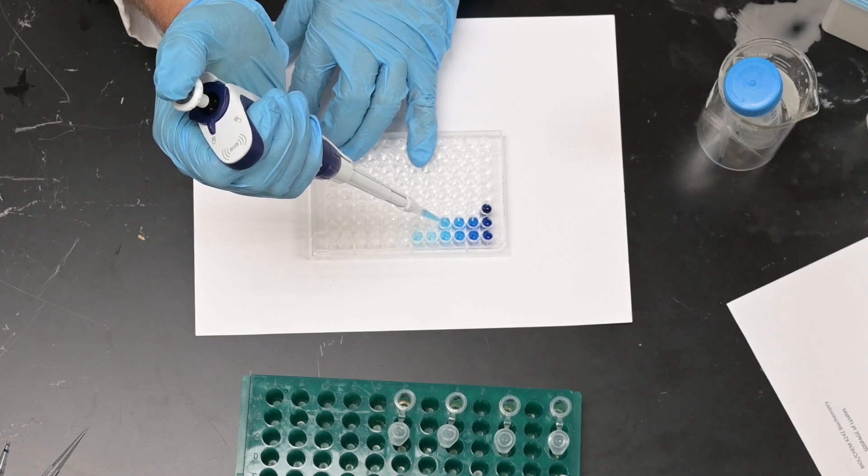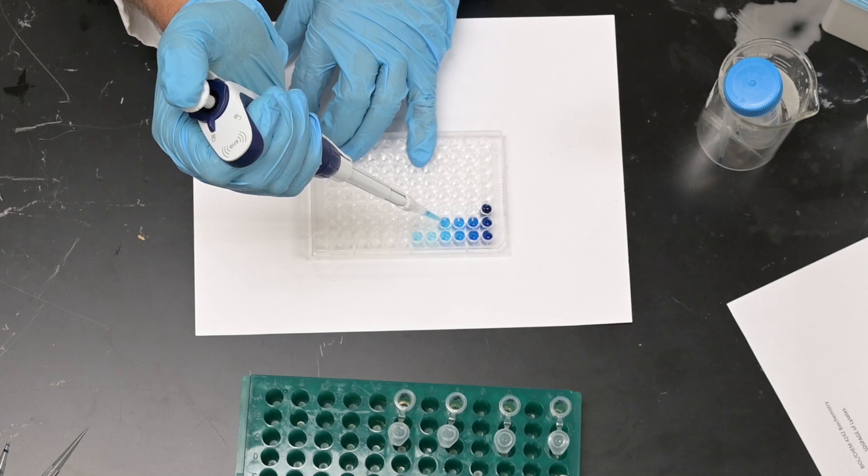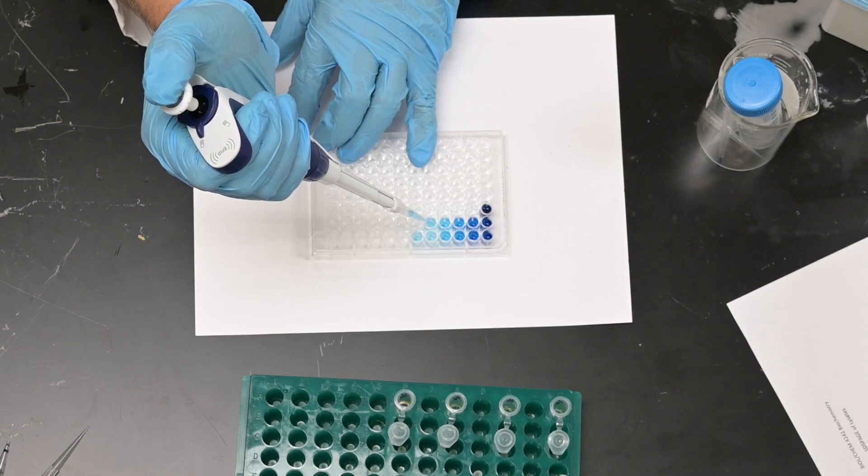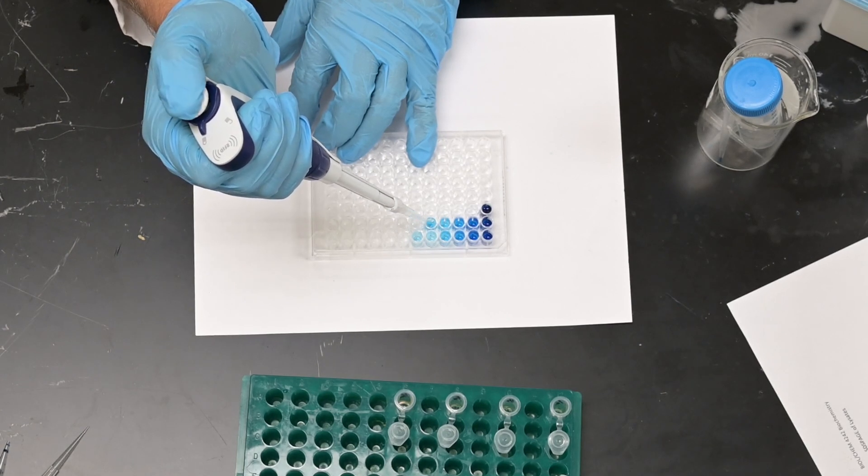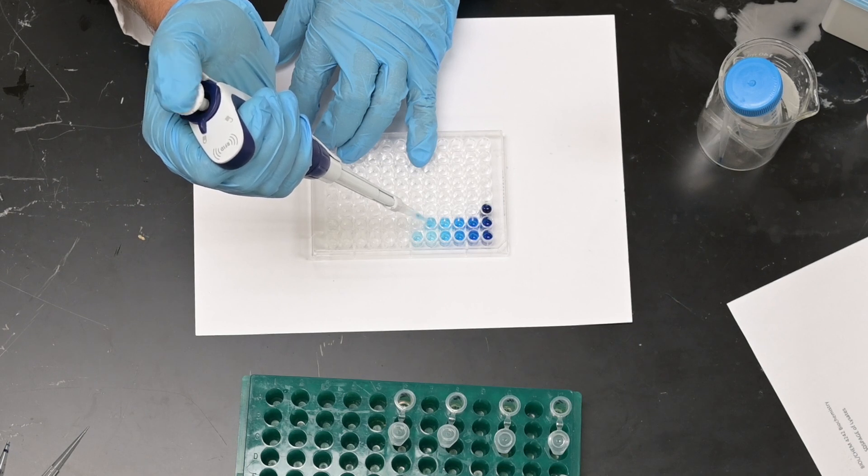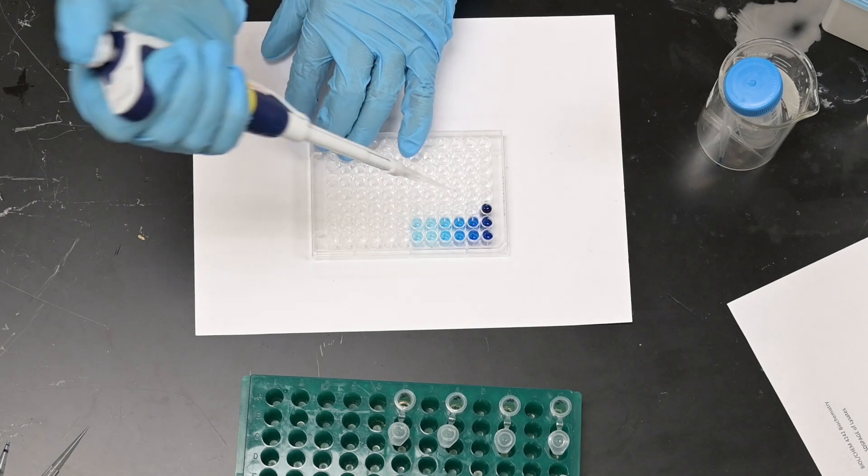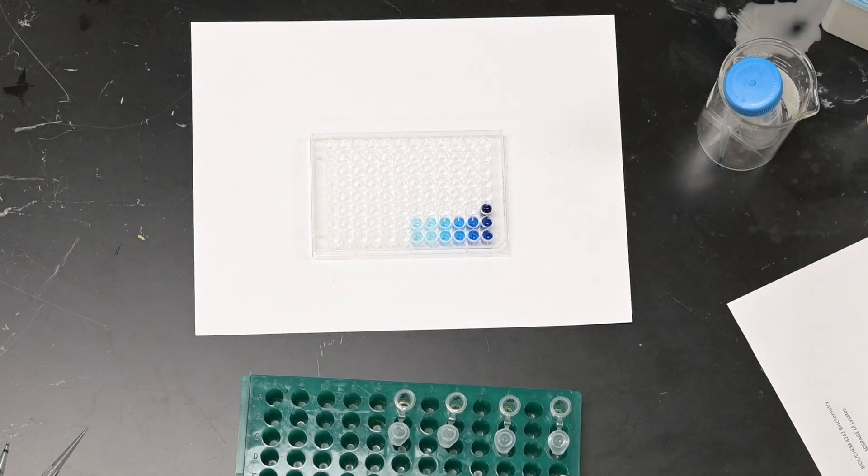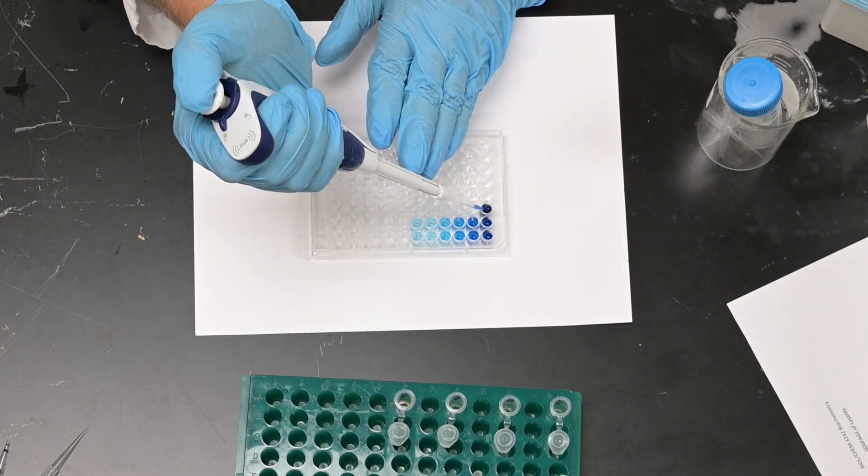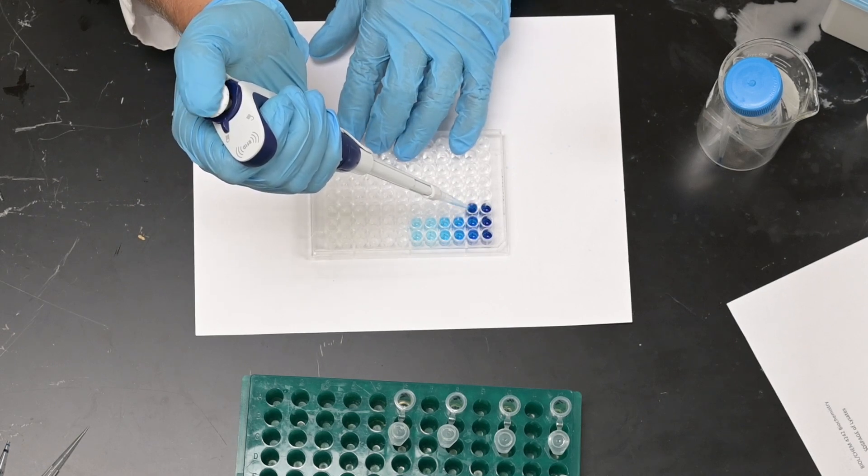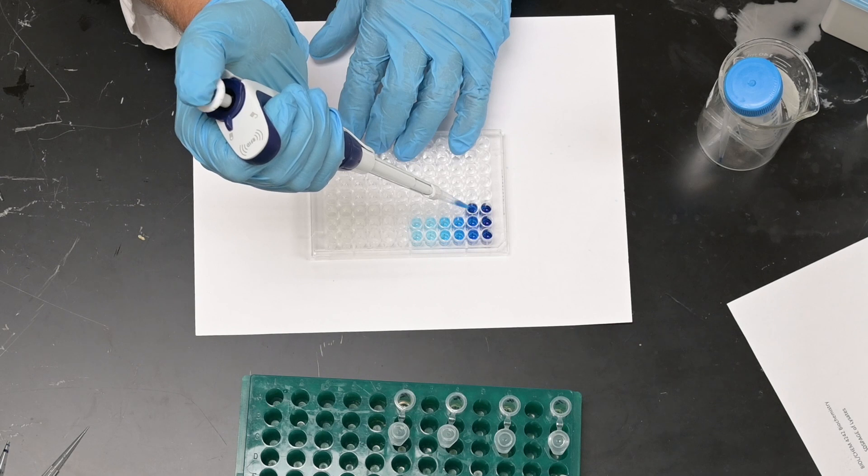I refer to this as pipette mixing. You'll hear me say go ahead and mix the samples using your pipette. This is what I mean by pipetting up and down. Now I'm doing the last sample and I'll take 150 microliters out and put it in that other well. Now we'll go through here, remove the tip, and do this to the C row.